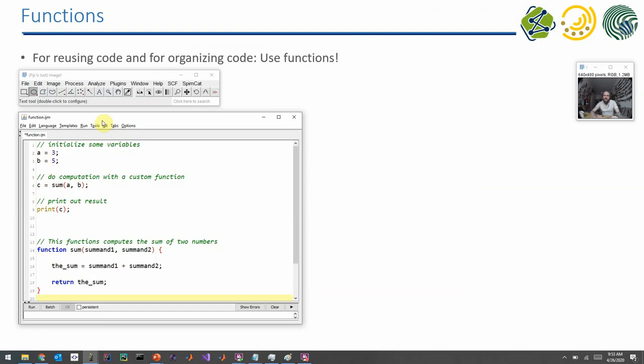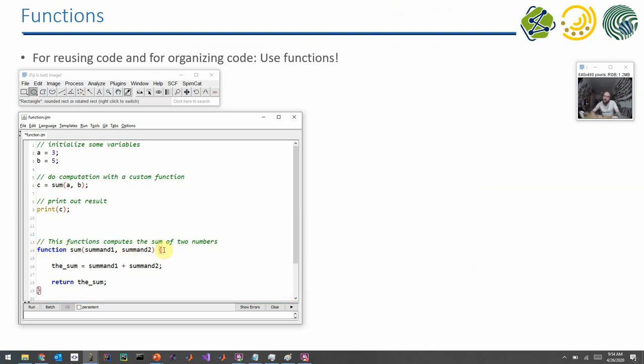So let's start with functions. You have seen a couple of functions already. For example, when you call the open command which opens an image for you, this is a function which is executed. But you can also make your own functions, custom functions, by defining with the function statement and a block with curly brackets.